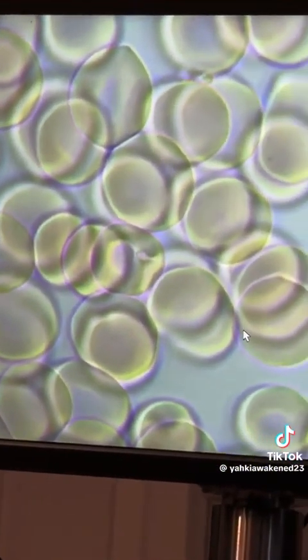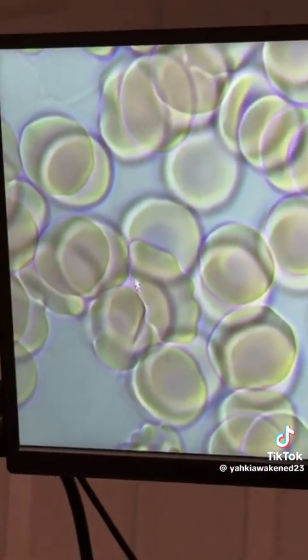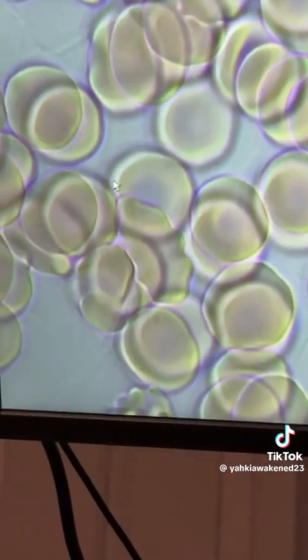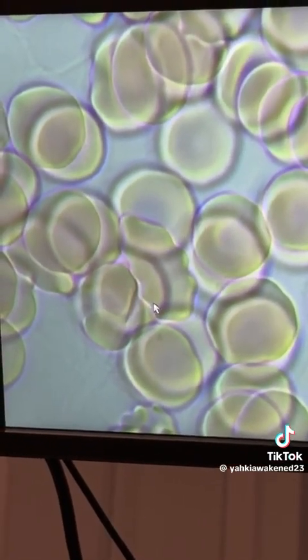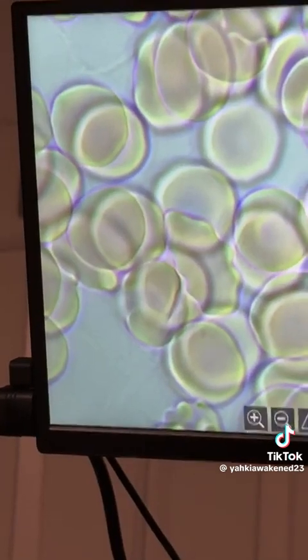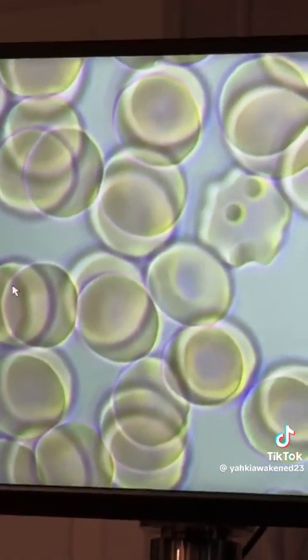So we're going to look around and see what we can see. I'm seeing a bunch of, this right here is called an elliptocyte. An elliptocyte is when the cells start taking on an oval pattern. And this is the lack of oxygen that does that. And then if you can see more parasites. We see more fibrin or more immunoglobulin that's inside the system. Meat eating. You see more poikilocytes.